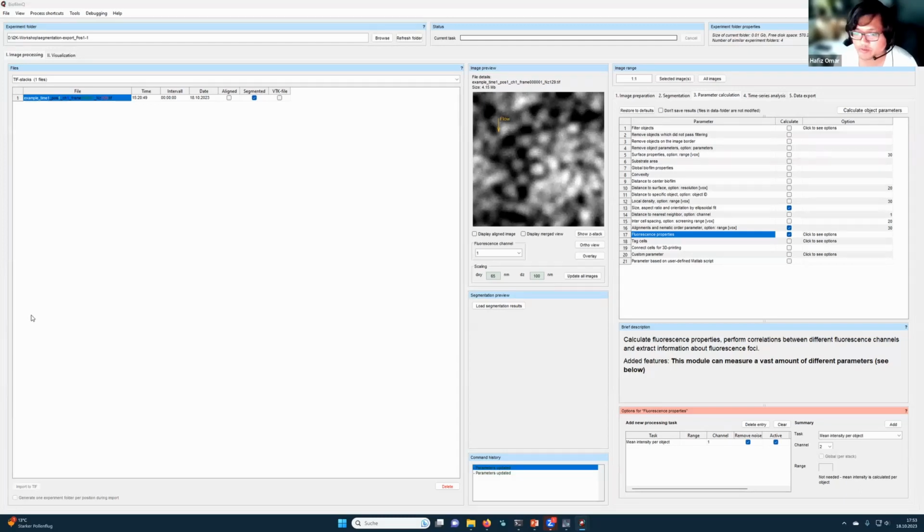Yeah, that's possible. Because BiofilmQ also has microenvironments. It's not just the cells, it also has a lot of metrics and so on. We did some treatments, and we want to extract all the information that we can. We have a lot of transmitted light that is unused, but if we can detect, at certain depths where the cells agglomerate or grow at a certain height, it could be important information for us. So just treat it as extra channels and it should be okay.